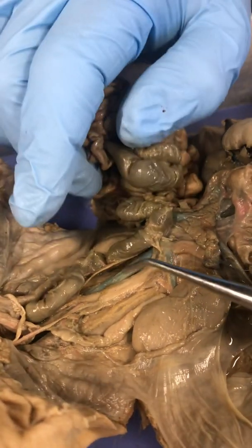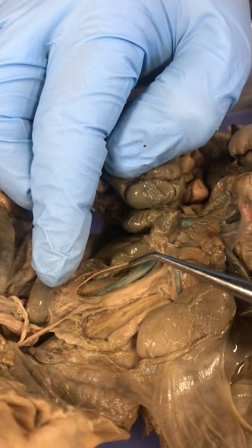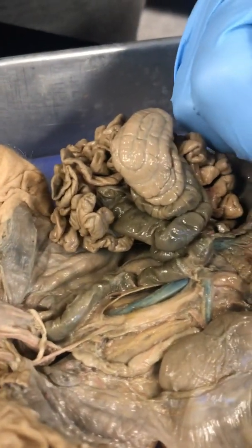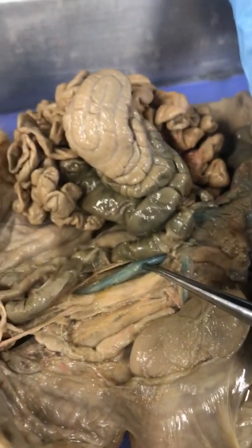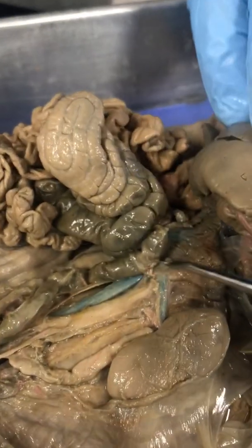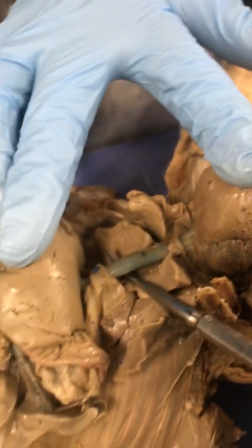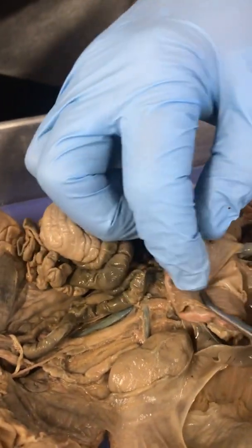Would you call that the posterior vena cava? Posterior. Now, if this were human, then it would be the inferior vena cava. So this is the anterior? Well, the anterior would always lie on top of the heart. So that would be anterior, and then posterior would be there. But you can see part of the posterior vena cava here, and then it repositions more central within the thoracic cavity. Right there. And I think I pointed out the diaphragm, right? Yeah, that membrane.